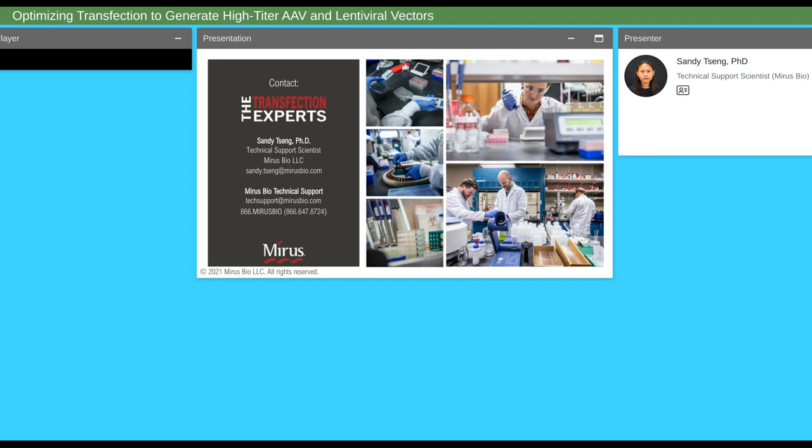The GMP reagent, which is going to be released later this year, about end of May, beginning of June, there is just one initial lot. However, following the initial release, I think in a few months following, we'll have an additional 2 batches. So depending on which format you want to evaluate, yes, there will be multiple lots to test.